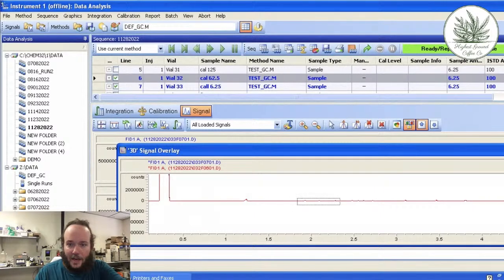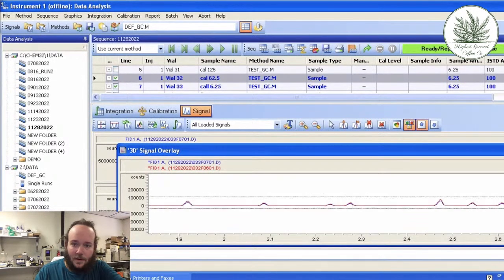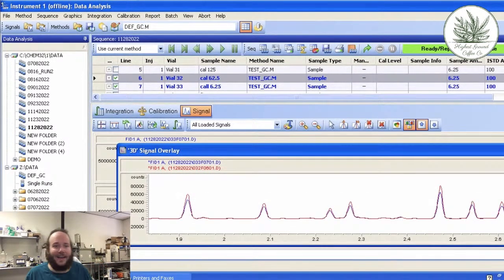We'll just go over the cannabinoids, which I can see are right here. Okay, so as expected, the 6.25 undoubtedly messed up on both of them. Again, going back to what I was talking about with the pipette. I think, using this one, which is the 10 to 100 microliter pipette, trying to use it for 10 microliters is just not effective. So I'm going to need to probably redo that standard.